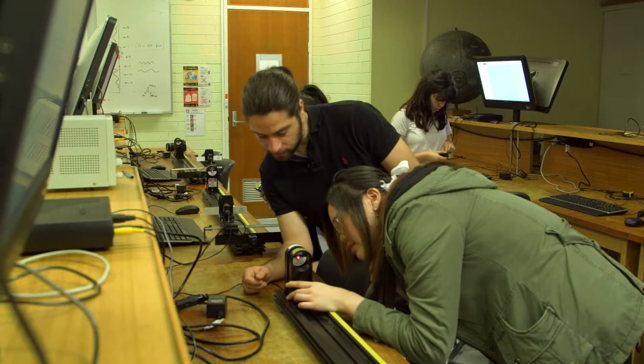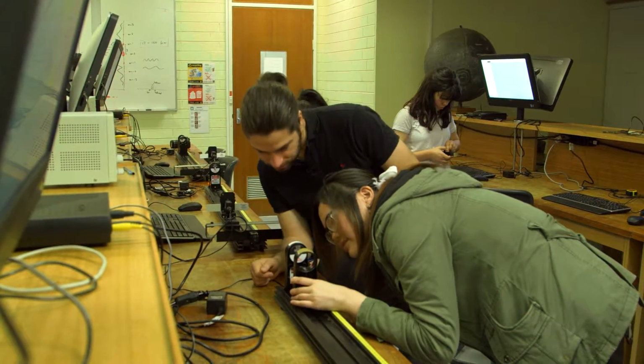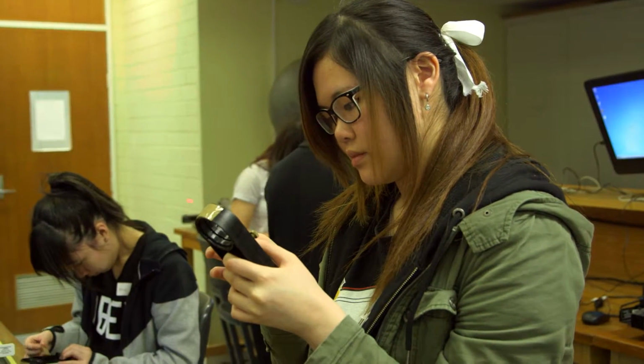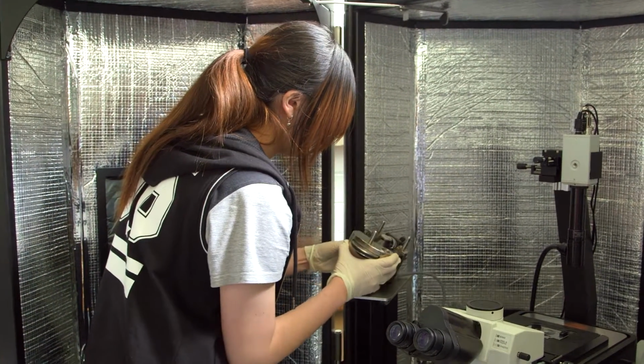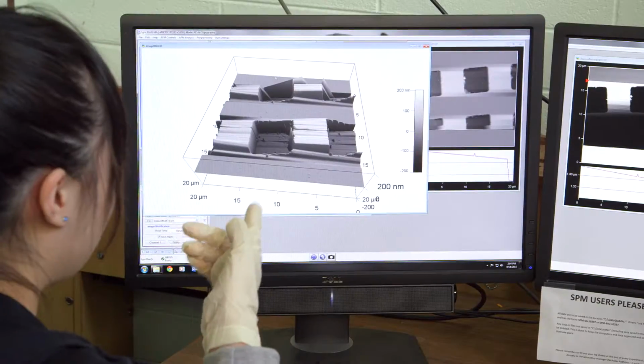The hair seemed to be thicker through the microscopy, but we think it's because we used different areas of the hair, because the root of the hair is much thicker. Yeah. So maybe that's why the results varied. So when we shone the laser onto our hair, we might have actually measured a different section of that hair, and then when we did the AFM, we could have probably measured a tiny bit further or closer to the hair, and that depends. That's why we have varied results for the width of our hair.